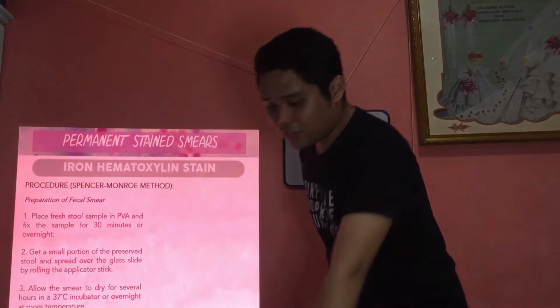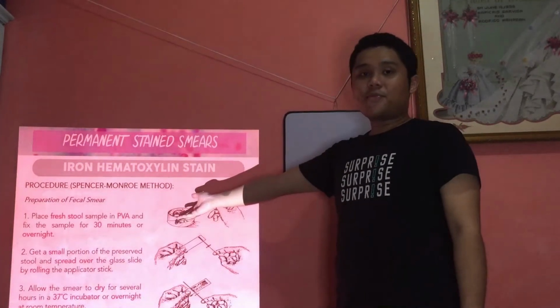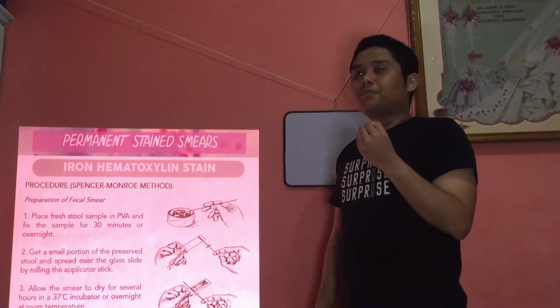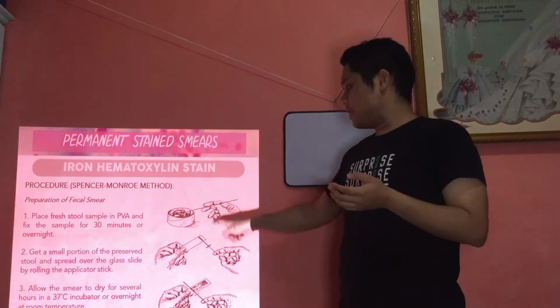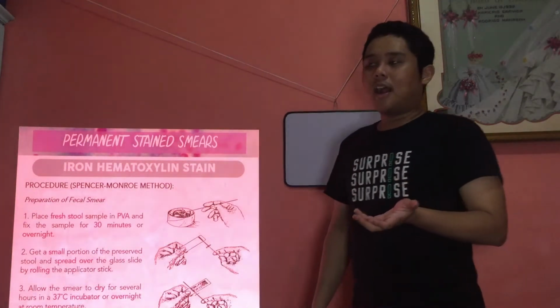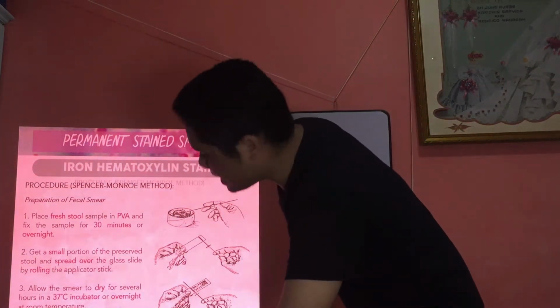Here's an example of the picture. Here is your sample, your PVA fixed sample, either 30-minute or overnight, then the applicator stick, roll, and here is now your fecal smear. So that's the first thing we do. Next is for our staining.